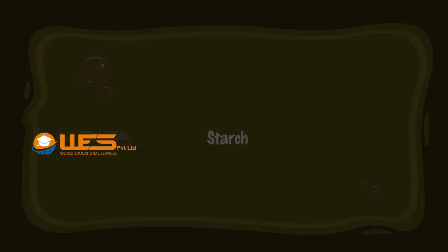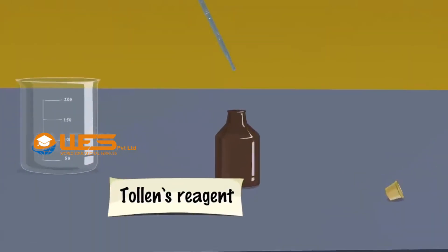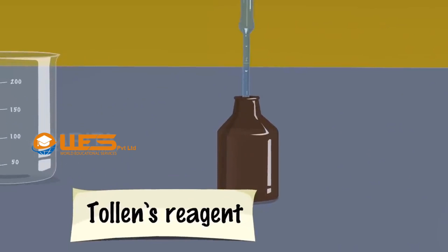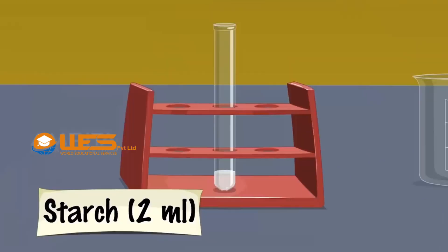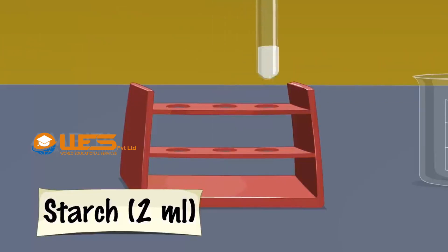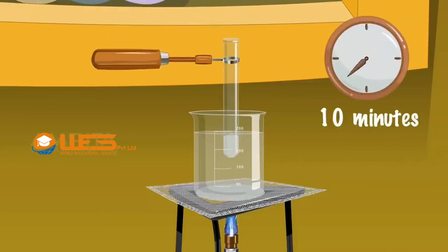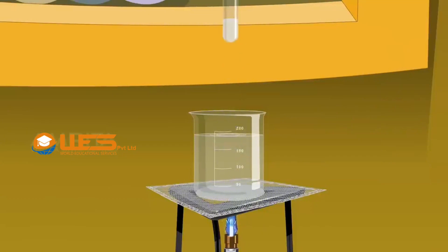Starch. Take 2 ml of Tollens reagent using a dropper. Add it into a test tube containing 2 ml suspension of starch. Remove the test tube from the rack using a test tube holder. Place it in a boiling water bath and heat for 10 minutes. There will be no characteristic change, indicating the absence of reducing carbohydrate.